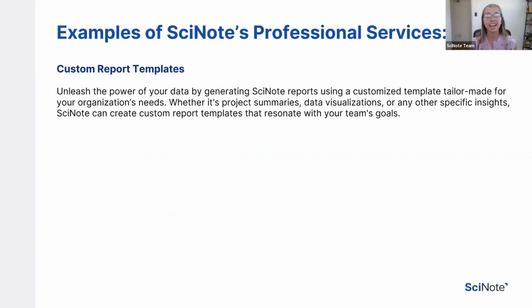I like to ask, are you tired of manually laboring to create, edit, or format your reports from your project? Instead of using SciNote templates for reports, we now have the option for you to create your own template. Imagine a seamless process where all you have to do is input your project details and the report is automatically generated in the format your stakeholders, your clients, anyone you're sending that report to, prefer. So let's check out an example of what we have here.